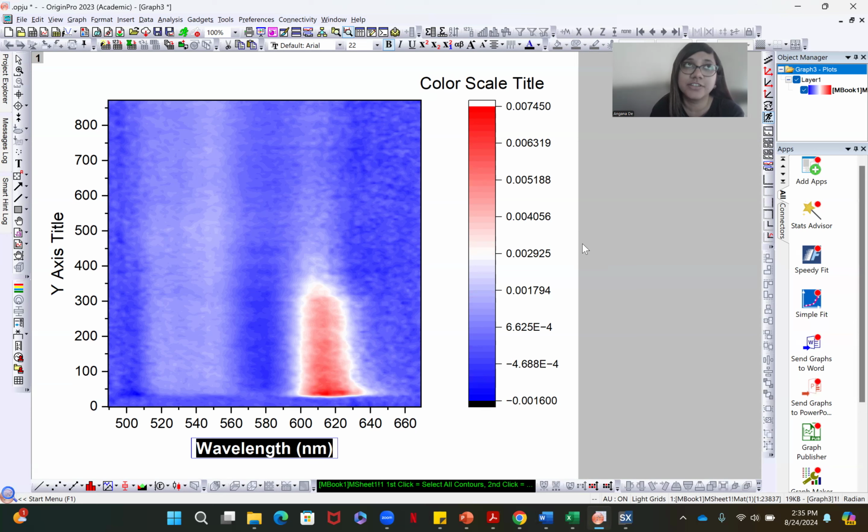I did find a video a few years back of how to do this on the internet. But then I forgot how to do it, and I couldn't find the video recently when I needed to do this type of data analysis. So I tried to remember what I had learned, and then I thought I might as well make a video myself for people in need.